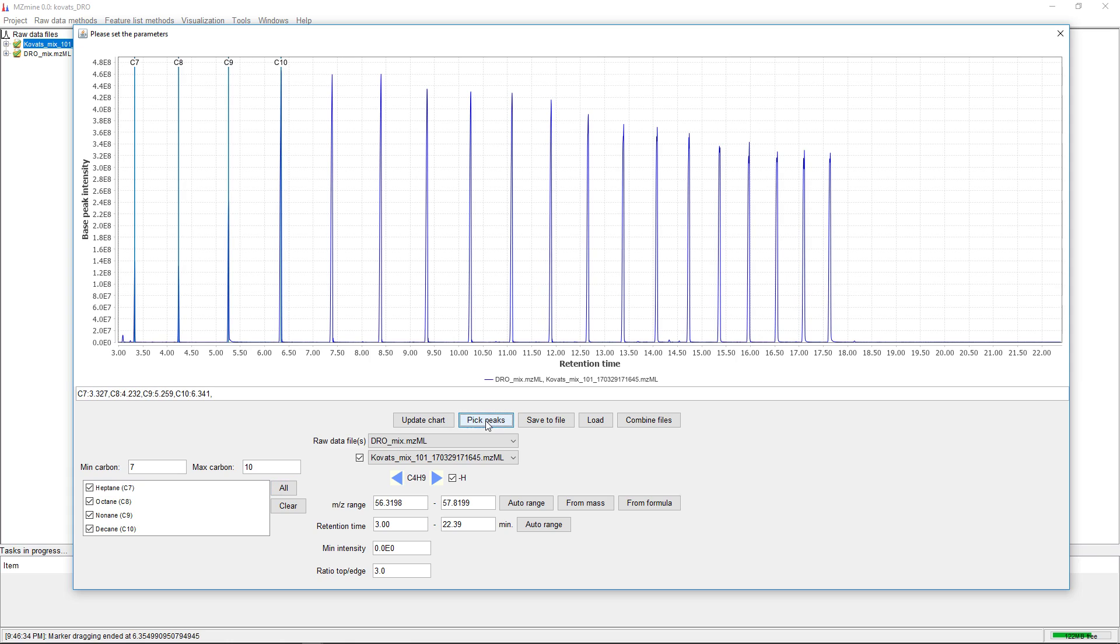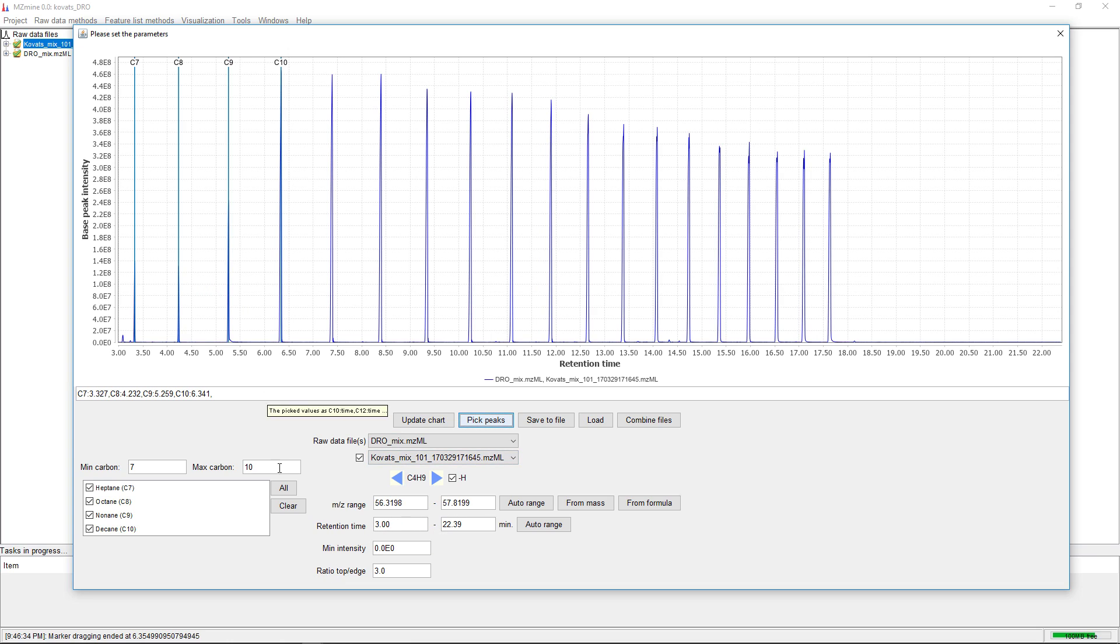The way to work with this dialog is to click on pick peaks. It will directly pick the local maxima in the base peak plot. We have the minimum intensity and retention time window, which we can adjust.